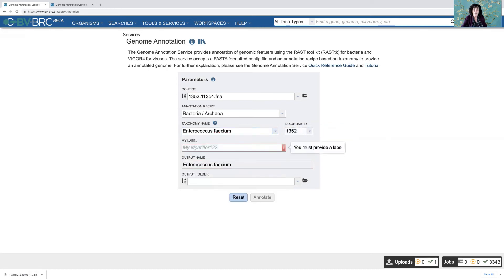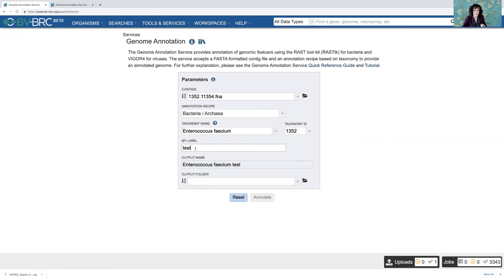Now I have to put in my label for this. So I'll just call it a test. We're almost done. We've put in the data, we've entered the parameters, we've named it. We just need the output folder. Now I can create a new output folder if I want to.